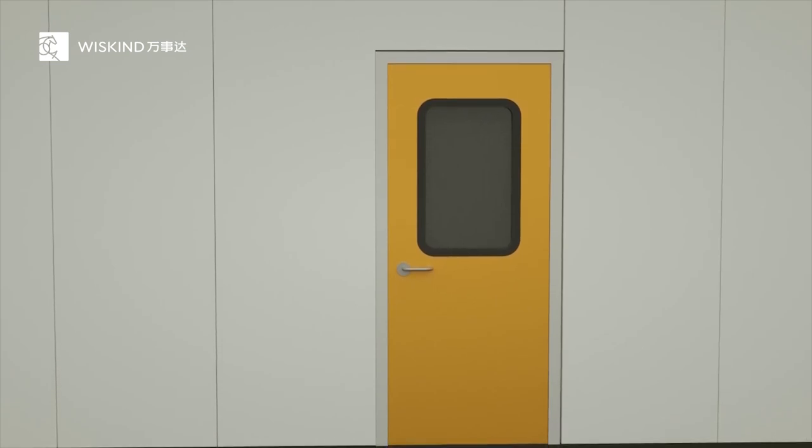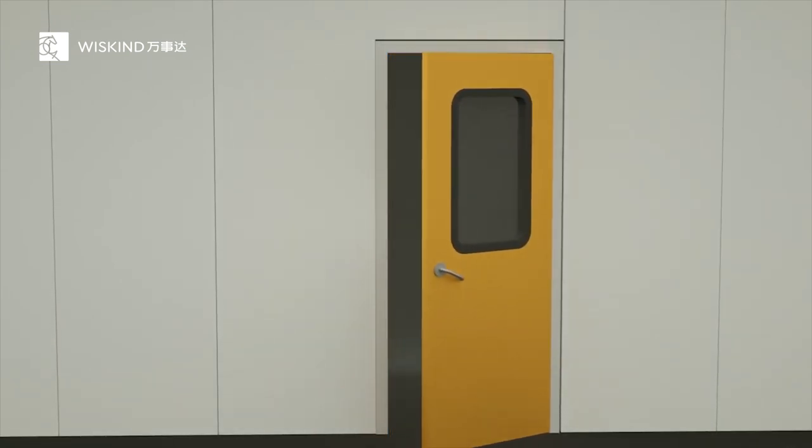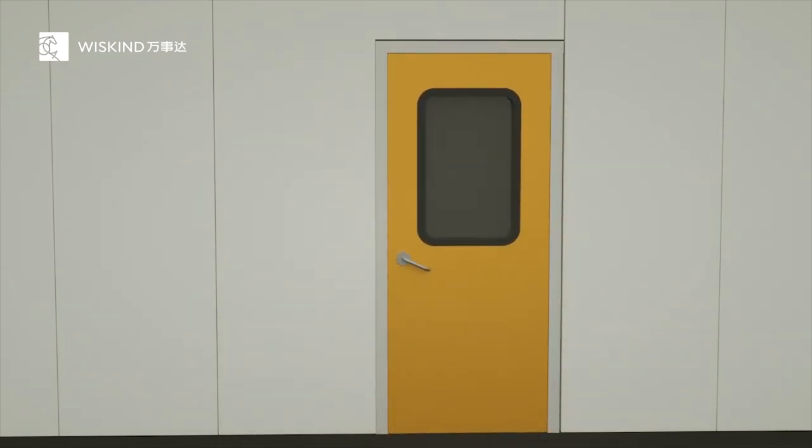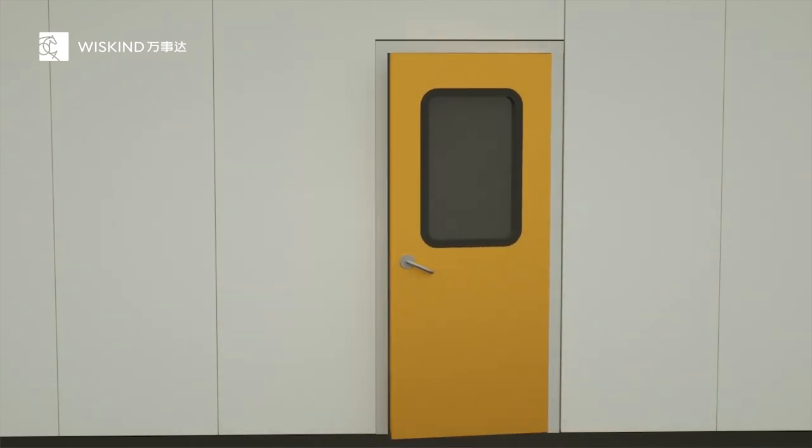In many clean room projects, we've found that the clean room door is often the first to be damaged. Compared with the entire project, the door is often opened and closed, resulting in more severe pressure and impact.